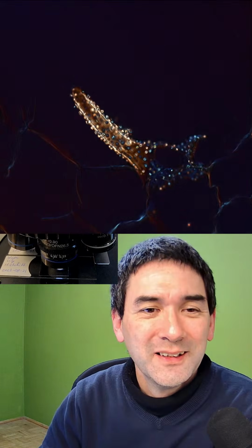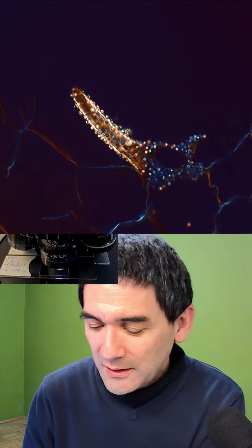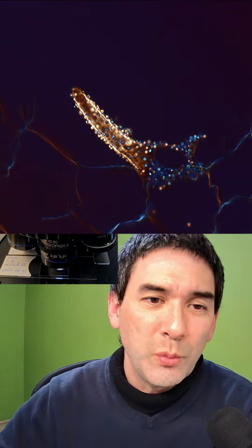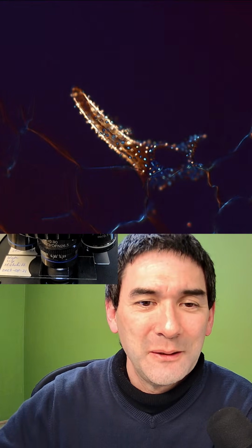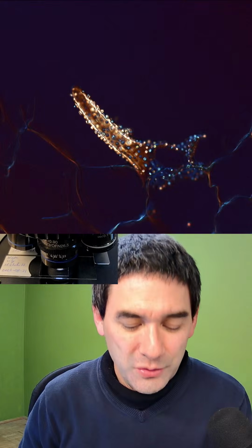Nice looking. Again, these are crystals, and the cells that form them inside the water lily are called idioblasts, for whatever reason. So idio means different. So these are cells that are kind of different. And that's also something that I just wanted to show you here.